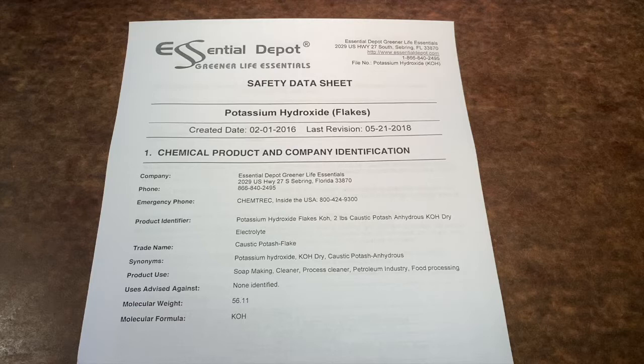As with all new experiments involving hazardous substances, a good place to start is with the Safety Data Sheet, or SDS. This outlines the principal hazards of a substance, exposure limits, recommended personal protective equipment, and advice for what to do if there is a spill or accidental exposure. Shown here is the SDS for dry flakes of crystalline KOH.